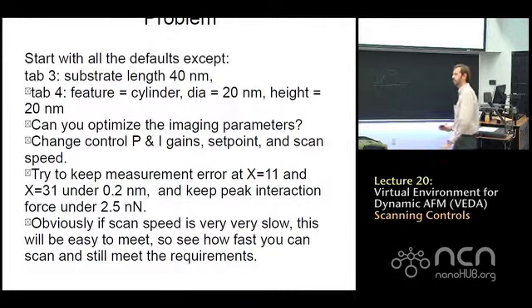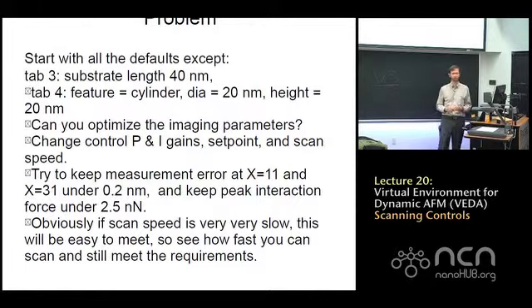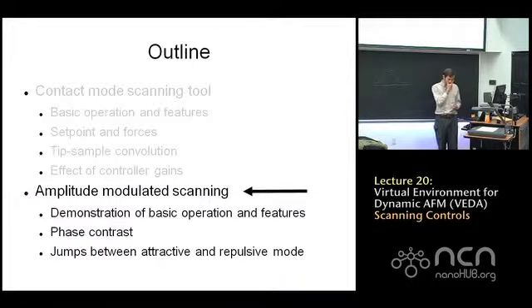Okay, I think we should move on. I see a couple people got it, a couple people are still working on it, but if I want to get through amplitude modulated scanning, I think we'll have to keep going. So you can continue to work on this after class if you feel like it. So now we'll go to the amplitude modulated scanning tool.